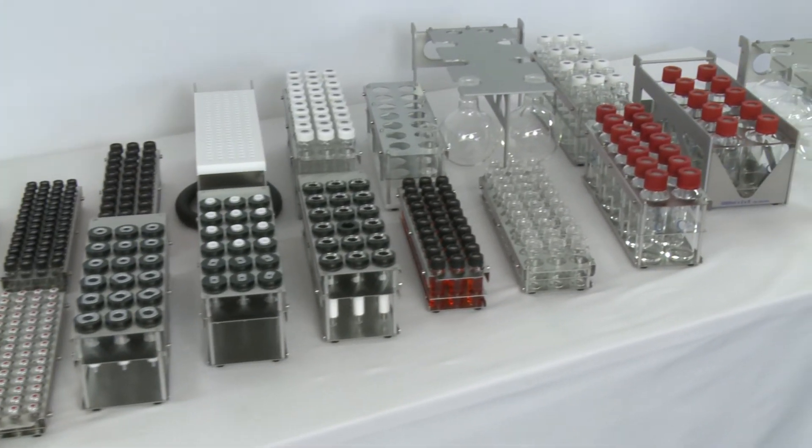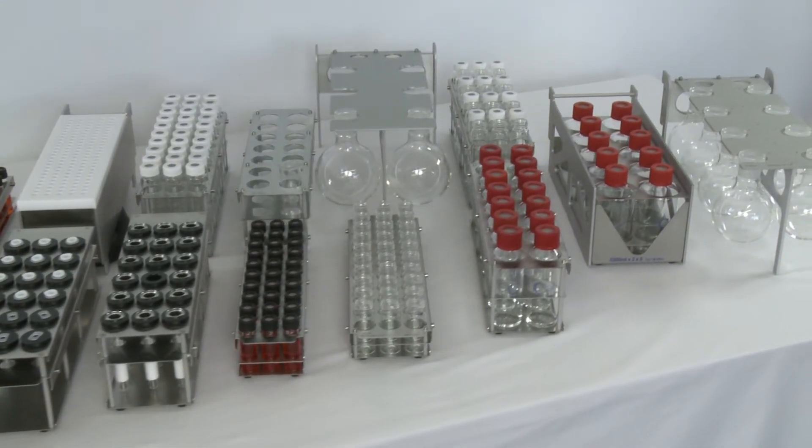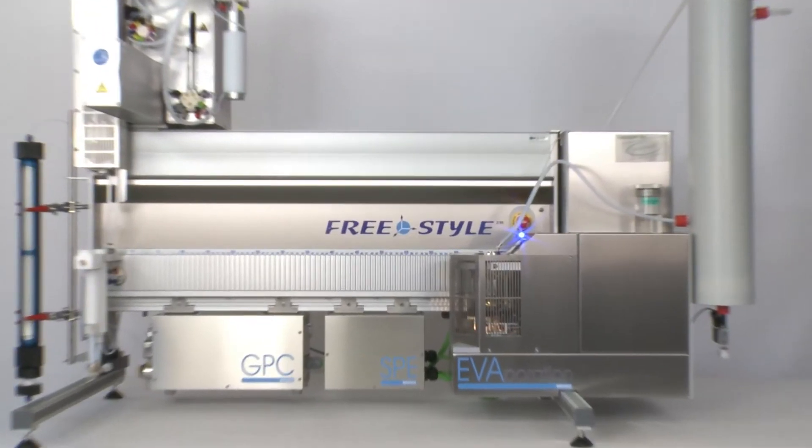Depending on the load, up to 180 samples can be automatically processed in one go, using only one platform.